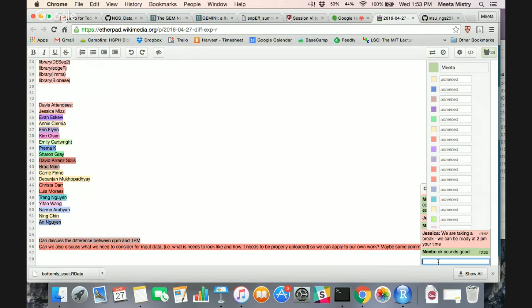And what about with Limma? So Limma, and I'll talk about the transformation that it does, is something we use when we have what we think is really noisy data and it's hard to extract signal. If you were to do a PCA or clustering and you didn't see your data segregating, it was just natural biological variation, or alternatively when you have a lot of different factors to consider. The Voom transform computes a weight which is applied to your original count data, which transforms your data into normally distributed data. And now that it's normally distributed, you have access to a lot of these mature linear modeling tools that were used for microarray data. So when you have a lot of different covariates, these tools can come in really handy.